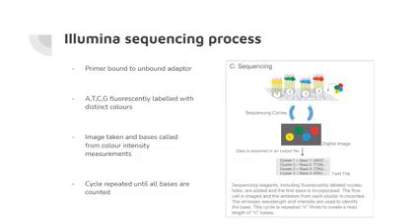And yep, so here, it starts at the top. You introduce your bases and you go down and zap each step with a laser, and you end up with this digital image here. For each cluster, there'll be a majority color of that cluster, and that's how you can tell which base it's currently on. And yep, the cycle is repeated until all bases are counted.